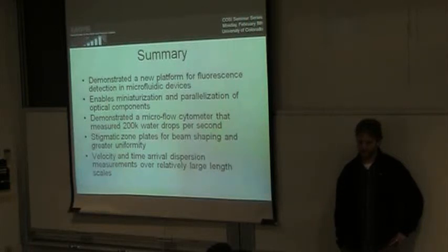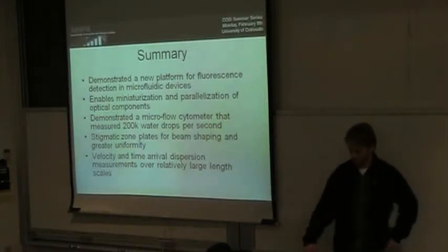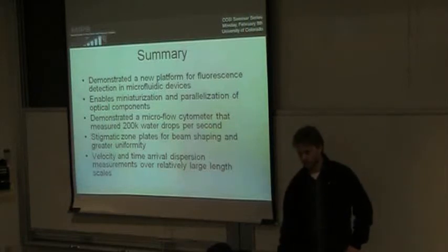So when you were actually detecting a signal, you were imaging the full aperture of the zone plate? Yeah, just imaging the zone plates onto the camera. I was just thinking for a detection problem, it seems like that would have lower SNR than just integrating all that with another lens. Right, so if you focus that image, you would have a higher SNR, and I would think you might be able to get a higher throughput. Is that a problem to do that? Put a single pixel onto the image. Well, I kind of am integrating it.